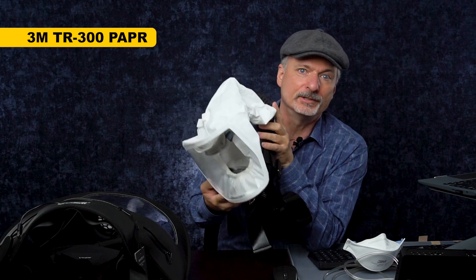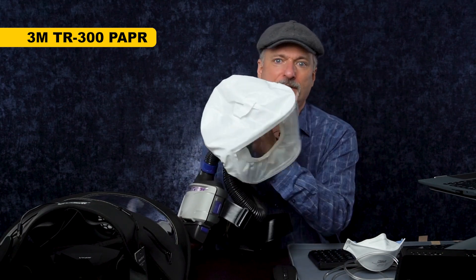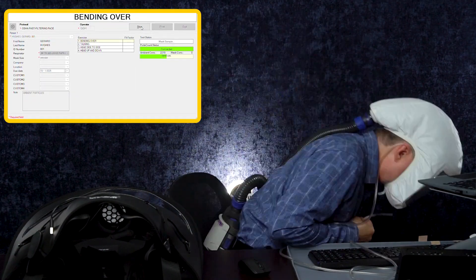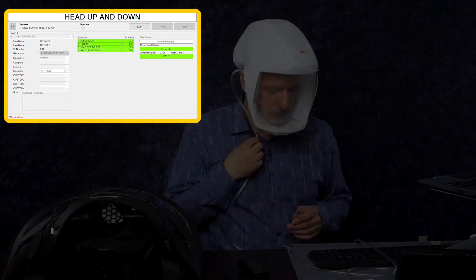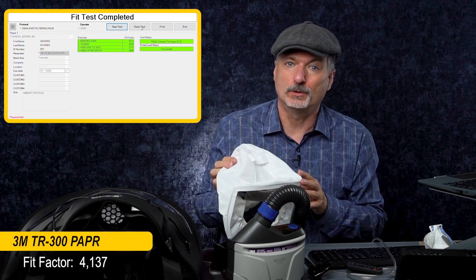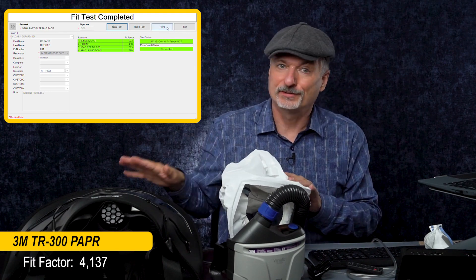This is the 3M TR300 — a version just for particulates with their simplest basic head top. This is smaller and lighter than the Biovisor. I've got as good or better visibility from this because the face shield moves with me and I'm not carrying the weight of the battery and blower on my shoulders — it's on a belt pack, so it's a lot lighter. The 3M performed very well, as you'd expect for a NIOSH-approved respirator: a fit factor of 4,137 overall. That is over 4,000 times cleaner inside versus seven times cleaner inside for the Biovisor.